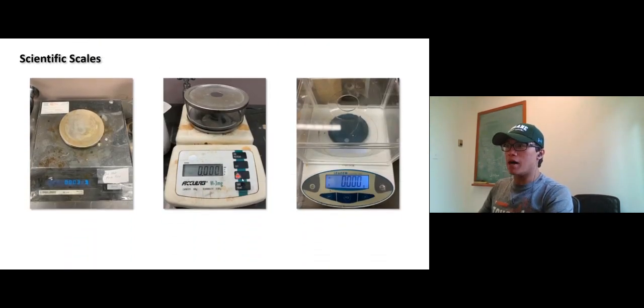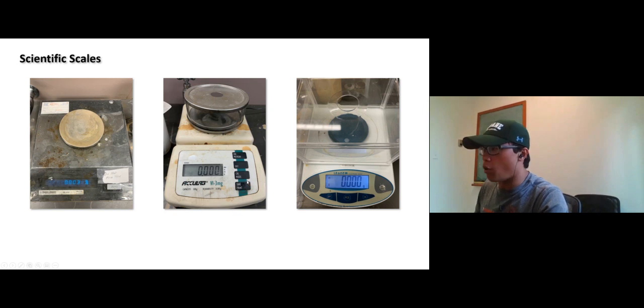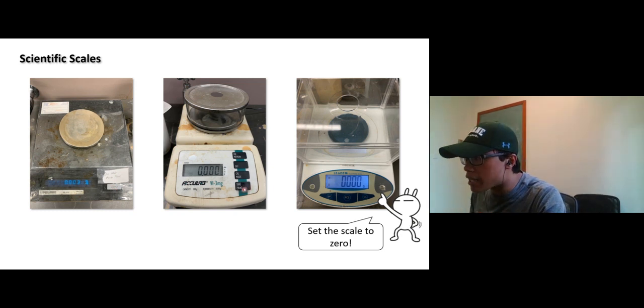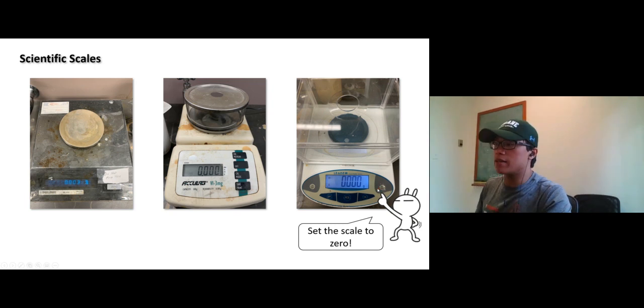There are a few types of scales, but I hope you don't have to use all this kind of dirty scale. This is like an old one. Oh, don't forget to tare to 0 every time before you make a measurement. Always hit 0 right here. What is it? Tare button right there. Tare or 0 right here. So set the scale to 0.